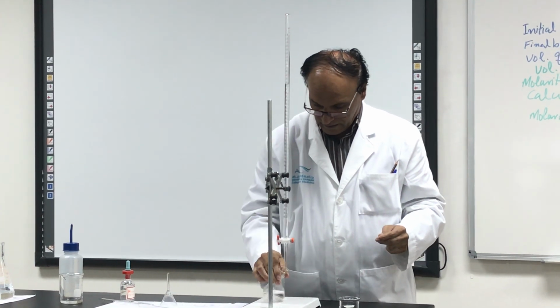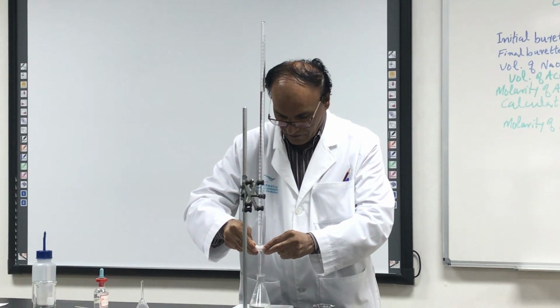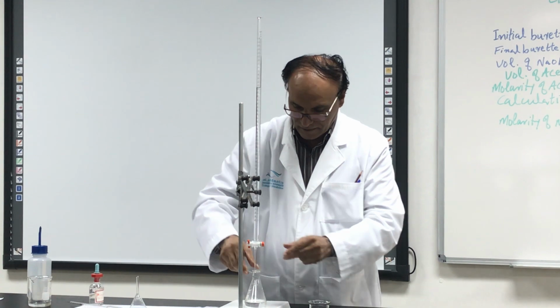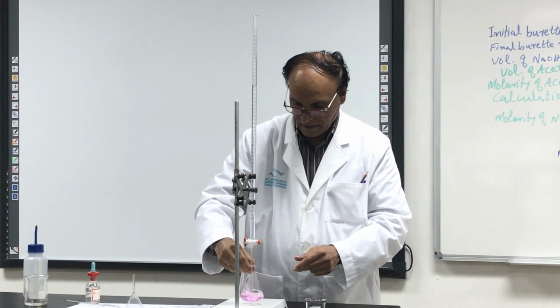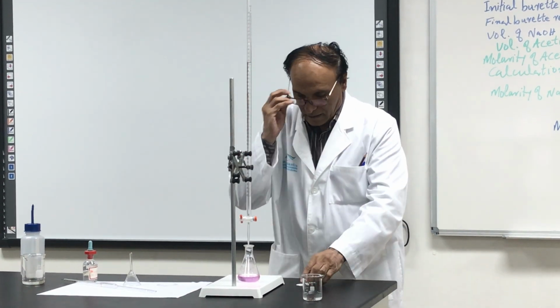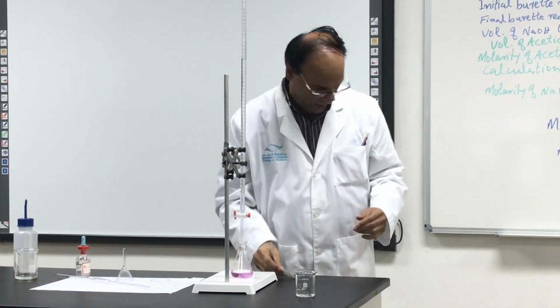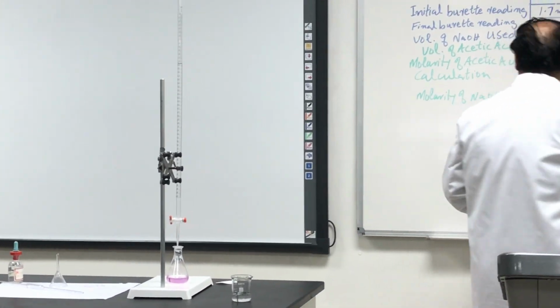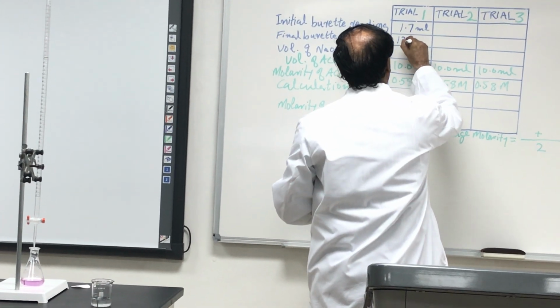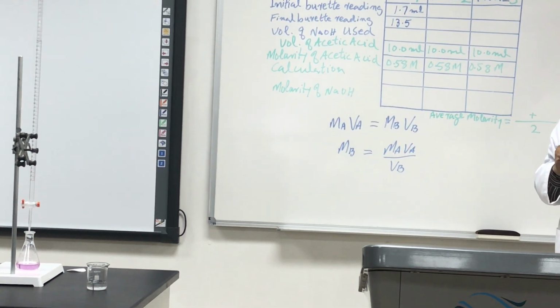13.5, and let me add one drop more, very slowly, like this. So with one drop the pink color comes, okay? And it is exact 13.5. So the final reading is 13.5, right?